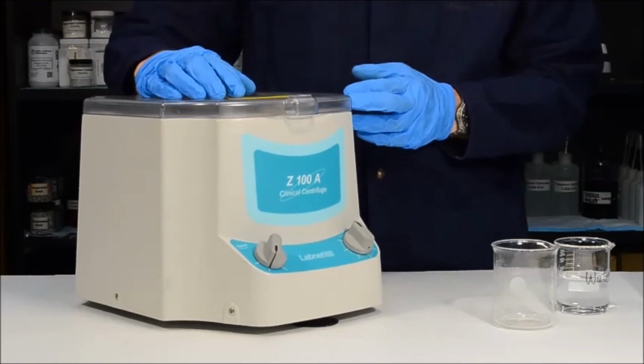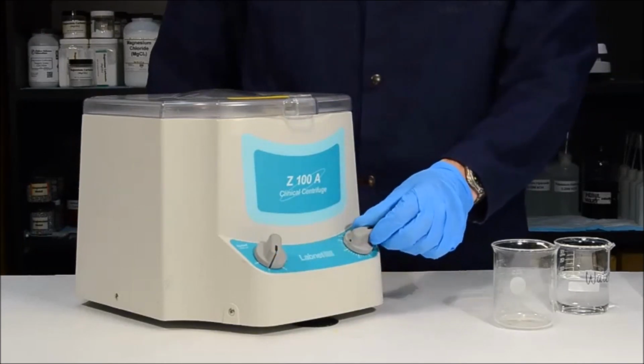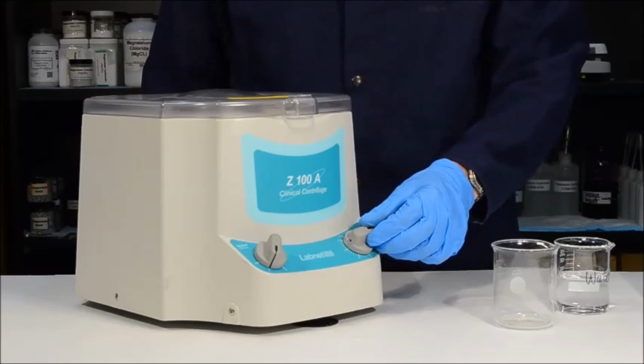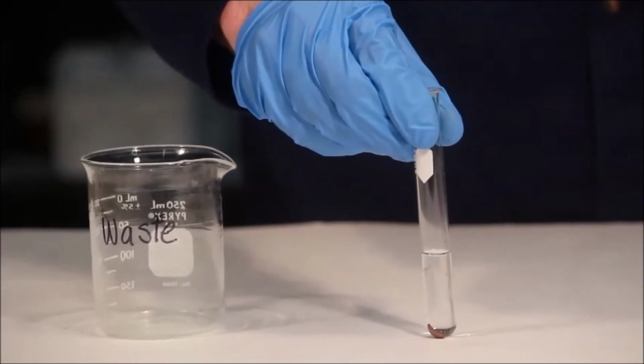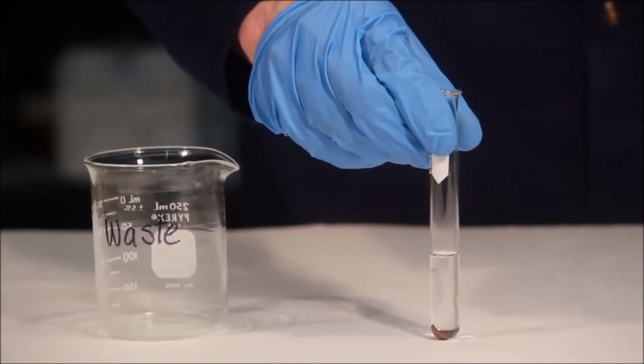Close the lid for the centrifuge, set it to 3000 RPMs, and then simply turn on the timer. You want to perform the centrifuge for approximately 1 to 2 minutes. After a few minutes in the centrifuge, you can see that all of the more dense copper metal has collected at the bottom of the tube.